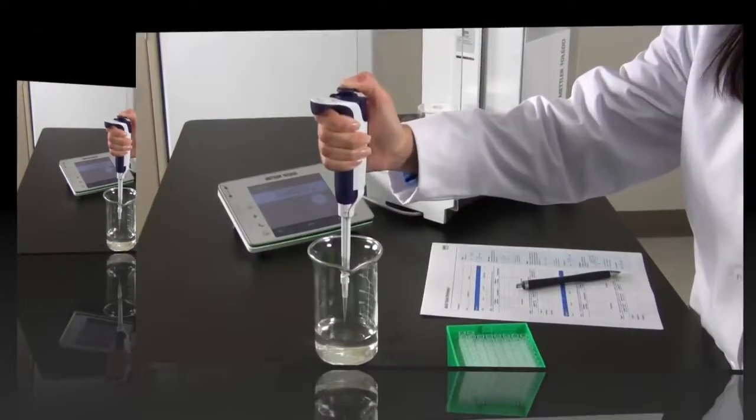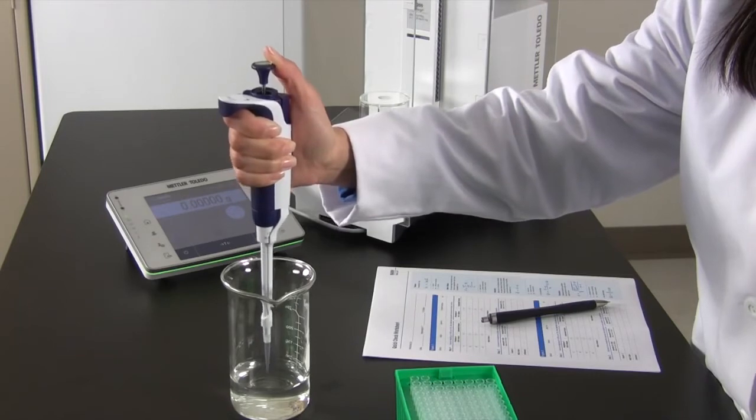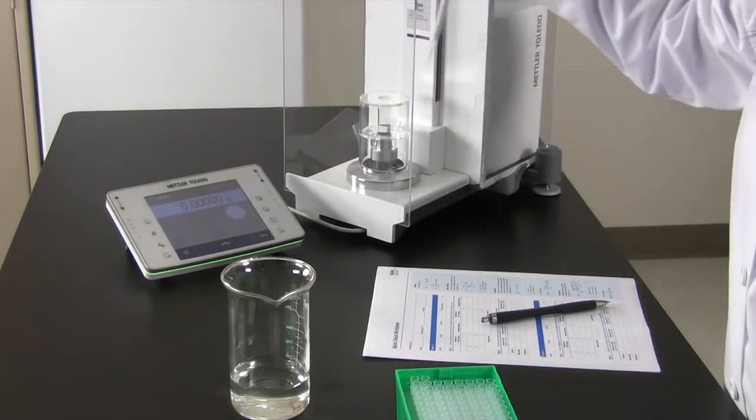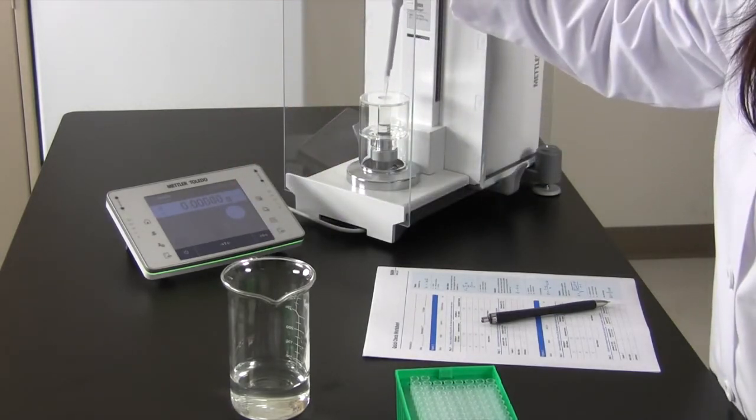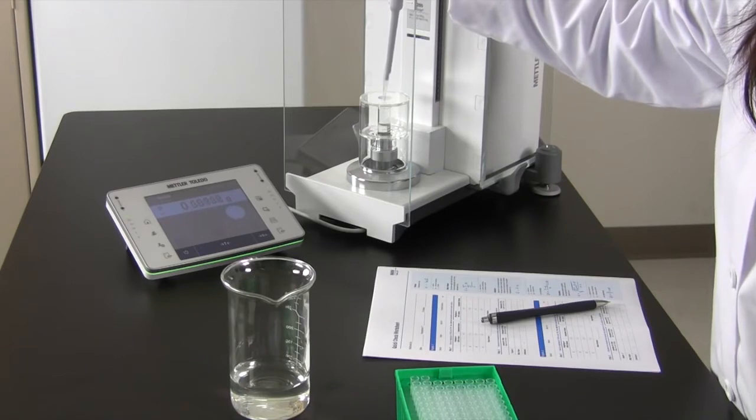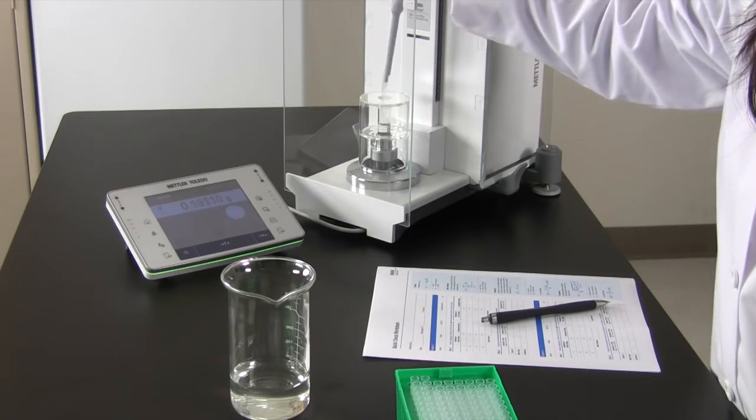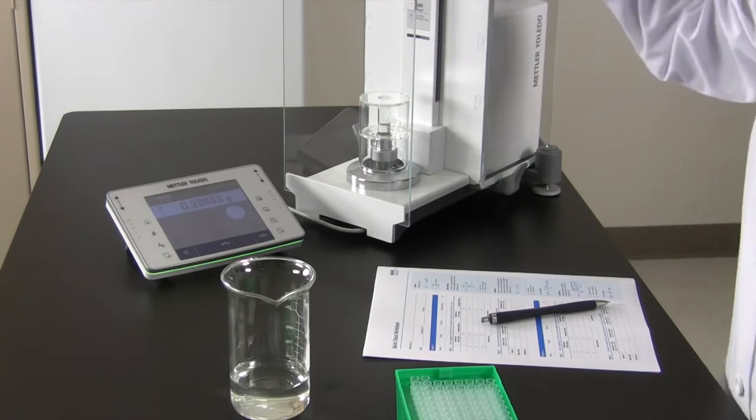Now, immerse the tip to the appropriate depth and aspirate the deionized water. Carefully move the pipette over the vessel on the balance and dispense the water, touching off against the side of the vessel to remove any excess liquid.